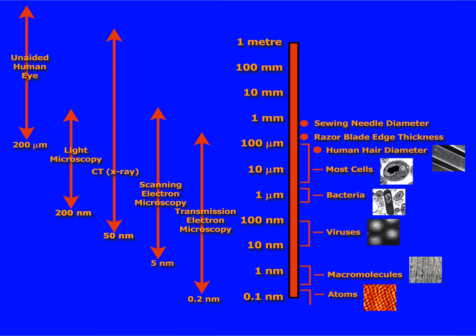X-ray microscopes, 50 nanometers, scanning electron microscopes down to 5 nanometers, and transmission electron microscopes are really the best of all, and they have a resolution of 0.2 of a nanometer. And there are transmission electron microscopes around now that can do a factor of 10 better than that. So that's 0.02 of a nanometer, and they can image atoms.